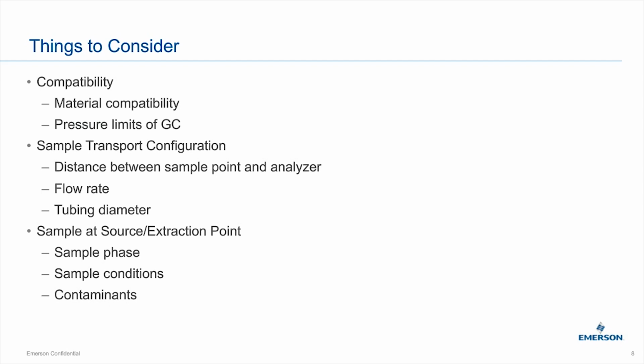Another item is flow rate. How fast is your liquid or your gas flowing through the system? And when I say system, I mean the sample handling system. That has an effect on the lag time. It also has an effect possibly on contamination.